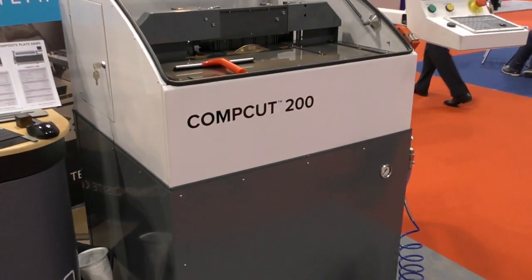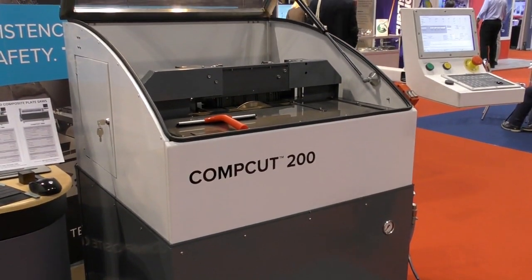We have three machines in our range. We have the CompCut 200, which is our small footprint machine, specifically for R&D centres and test centres who want to cut test specimens very easily. It's small footprint but low cost as well. Then we have two bigger ones: a 600 by 600 millimetre machine and a 1200 by 1200 millimetre clear panel size machine. For this event we've brought the smaller footprint machine because it's easy to transport and easy to show people what we do, as all our machines work with the same principle for cutting samples.